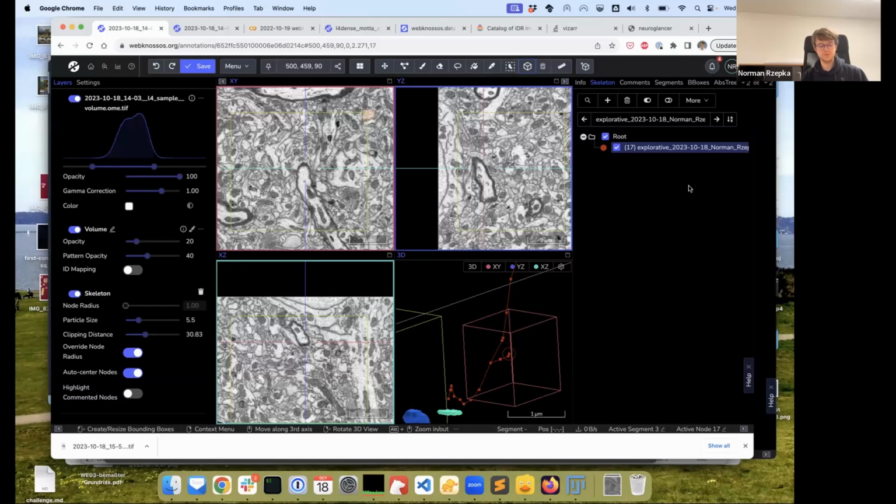All right. Well, then we're almost at the full hour. So thanks for coming. Again, feel free to try out Webknossos. So we have free accounts on webknossos.org. They basically have all of the features, and they're just limited in terms of the data that you can upload, because storage is not free. But if you have your data somewhere else as Zarr, then you can load it, and that won't count against your quota. So that also it can work.